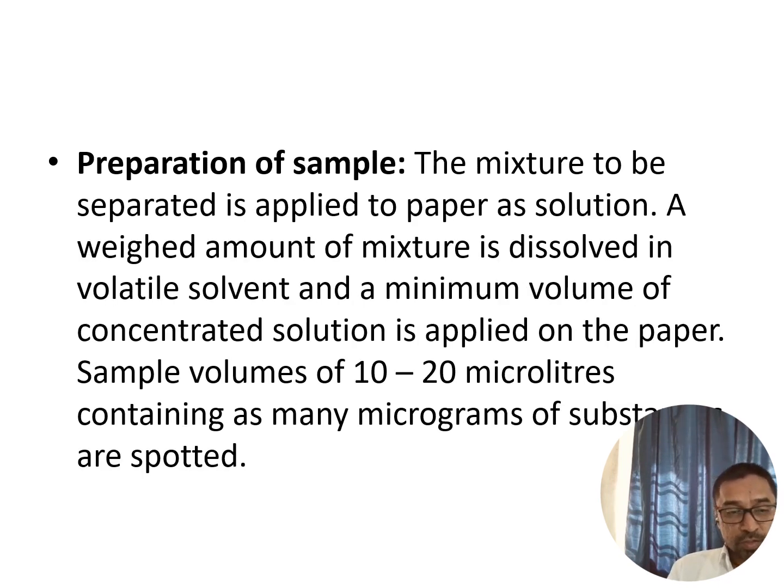This is a very important step, the preparation of the sample. The sample is prepared using the same solvent which is going to be used as the mobile phase for carrying out the experimental procedure. So we need to prepare a concentrated sample.